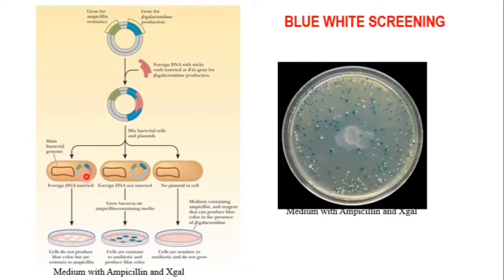Here you can see this foreign DNA is correctly inserted into the lacZ gene of this vector. So the lacZ gene is inactivated. This process is known as insertion inactivation. And this bacteria, with its lacZ gene inactivated, produces only a white colored colony.